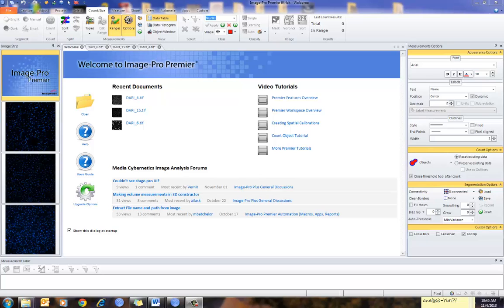This is a short movie showing ImagePro Premiere version 9.1 and how to set up the Data Collector feature. Data Collector is used to accumulate the data from multiple images in a single data table. In addition, it can collect either the raw or statistical data, or both at the same time.